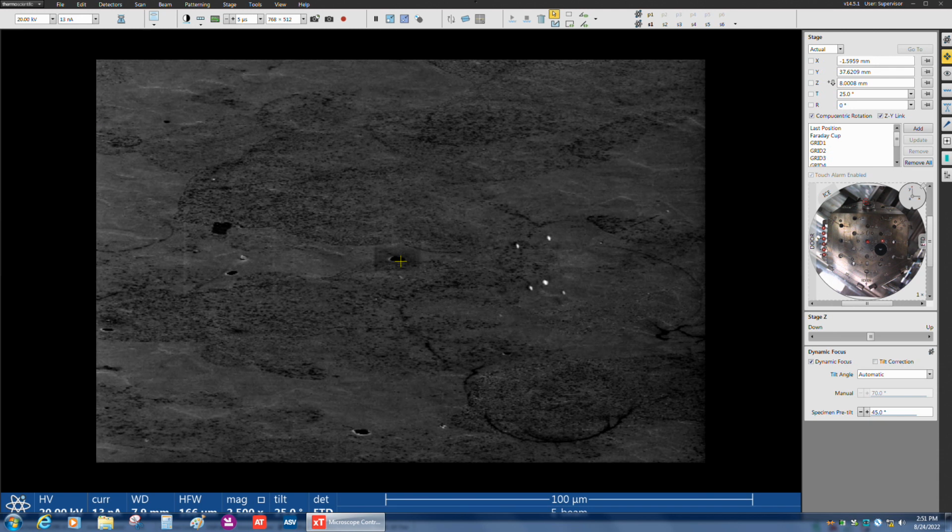So now you do have the option here to select an area to map. I don't recommend you do that because I've seen this cause issues with map distortions if the whole map isn't selected. That might be a bug that they fixed at some point, but I'm not sure. Under resolution, we have 3 defaults. If you're trying to get your best quality, I would go fine, obviously. You do have the option to input a custom step size, but usually I just default it to fine, and that works well. It calculates the step size on fine based on the horizontal field width.